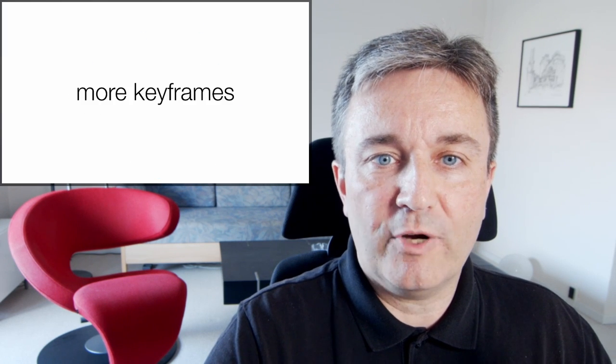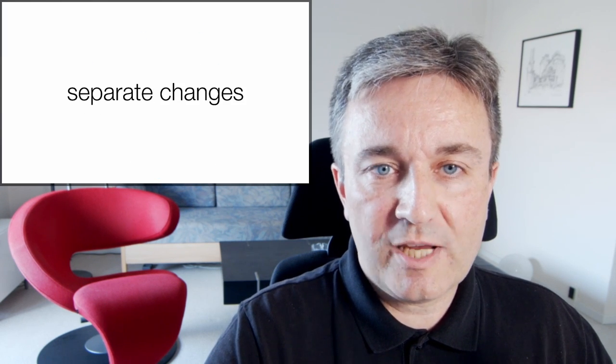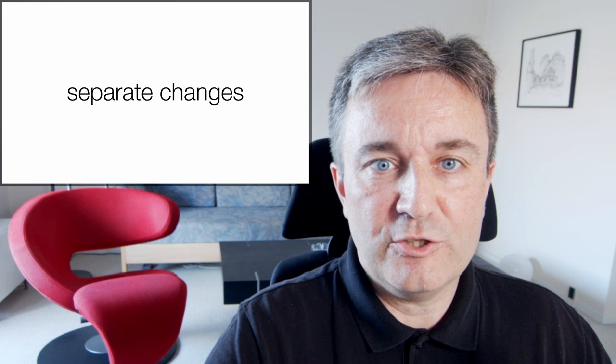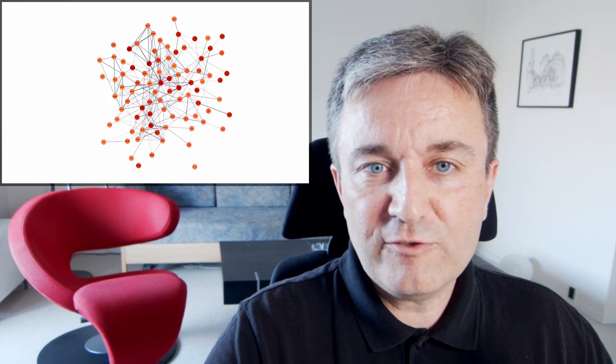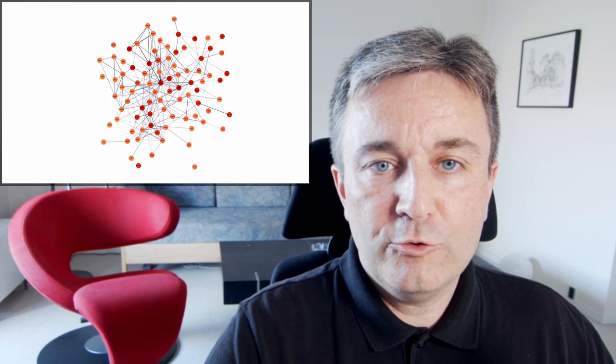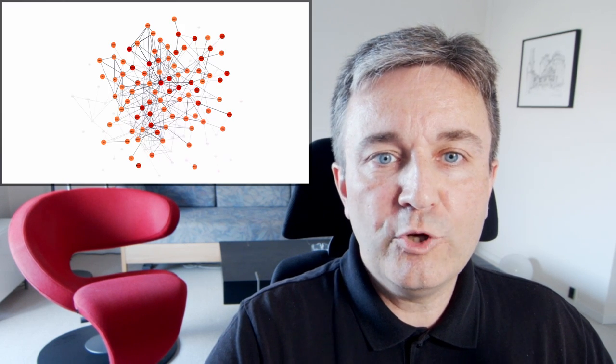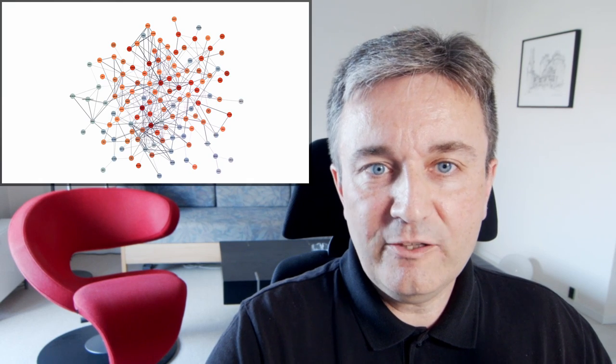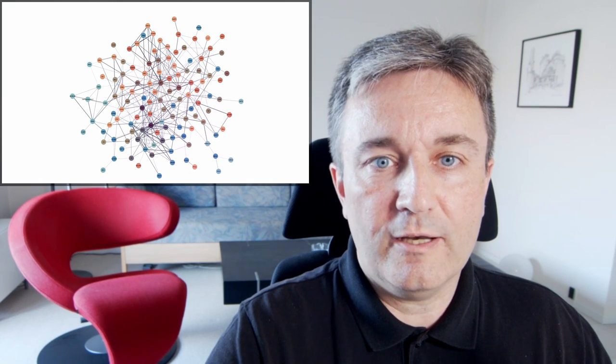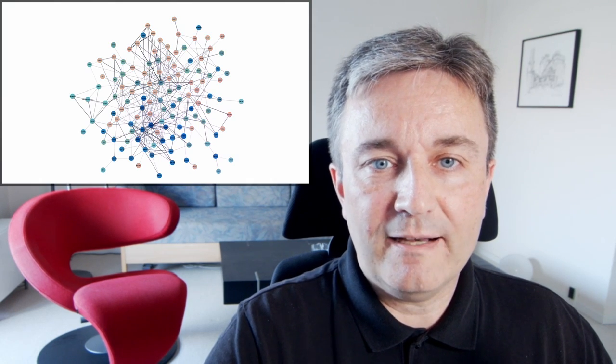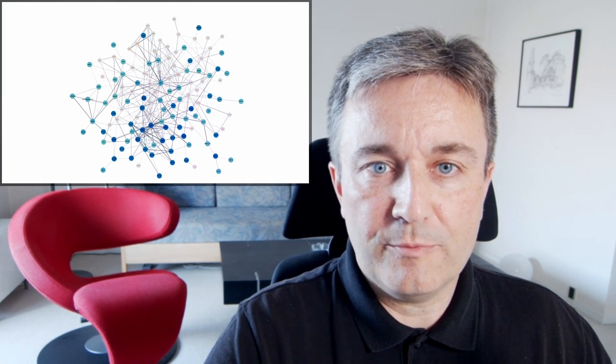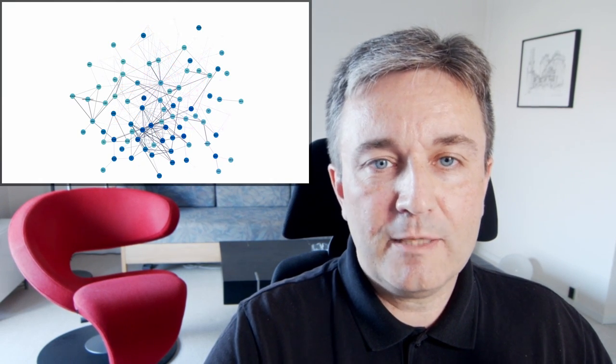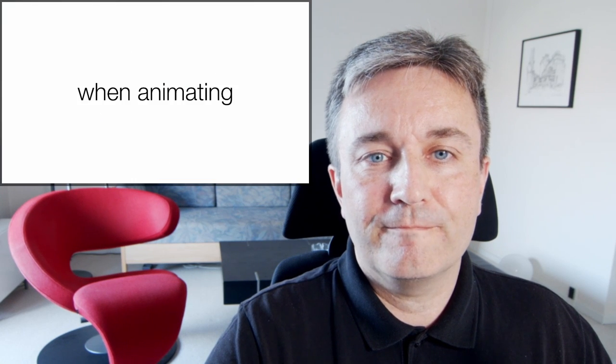By having more keyframes, you can separate out the changes. This video, you now have the new nodes first appearing, then the nodes changing color, and finally nodes disappearing. That makes it even easier to follow.